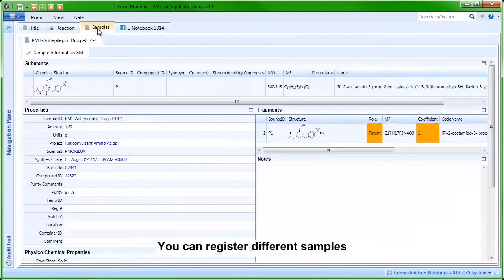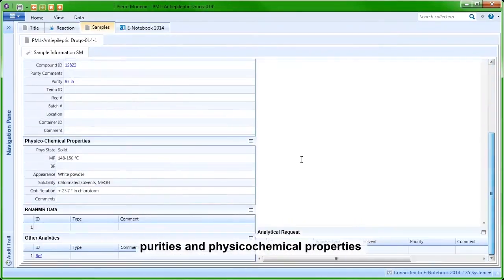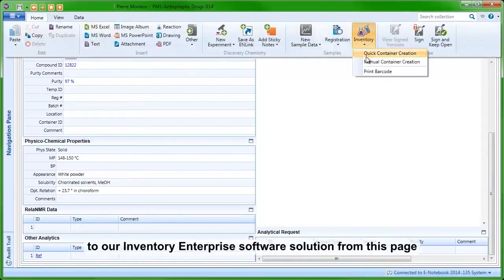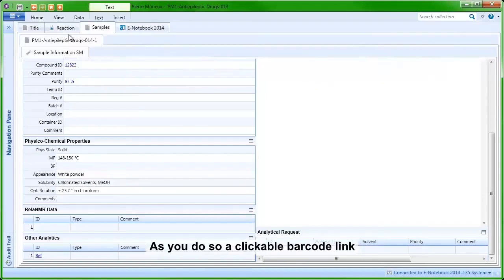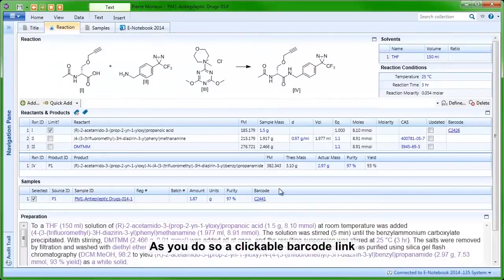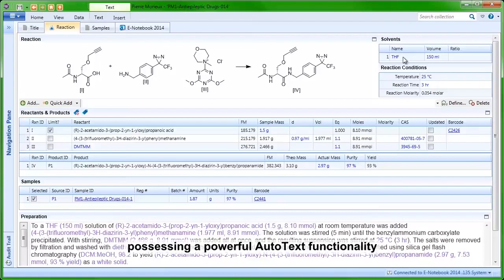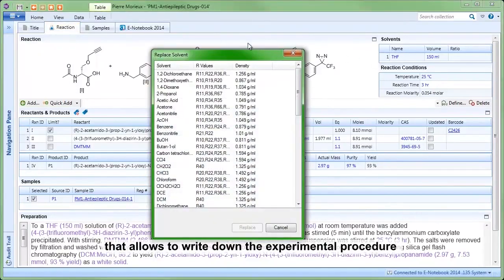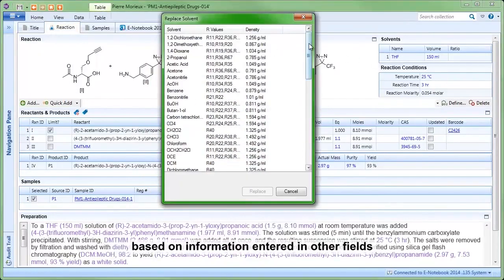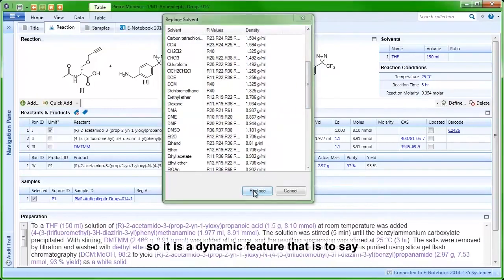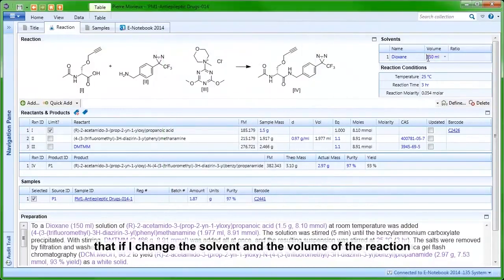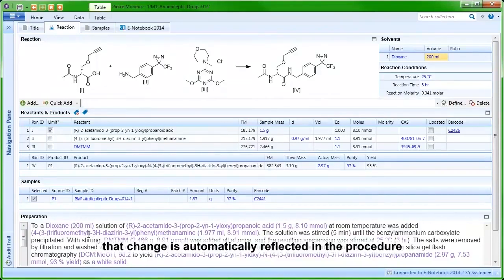You can register different samples that you have created with their associated purities and physicochemical properties, and you can also directly send them to our inventory software solution from this page. As you do so, a clickable barcode link will be inserted in the samples table. The experimental procedure below is a text field possessing a powerful autotext functionality that allows you to write down the experimental procedure based on information entered in other fields. It is a dynamic feature — if you change the solvent and the volume of the reaction, that change is automatically reflected in the procedure.